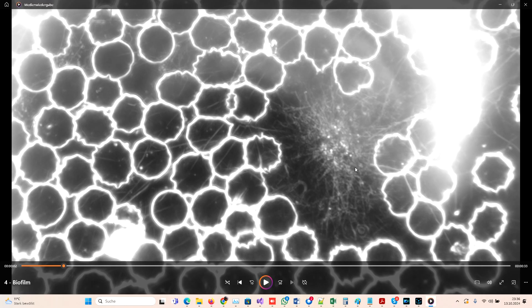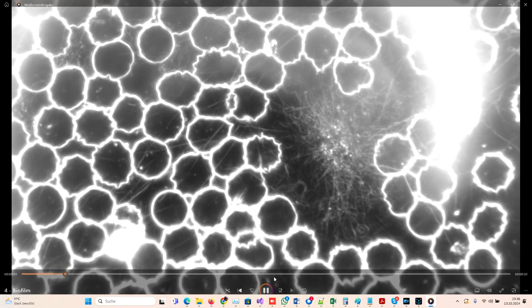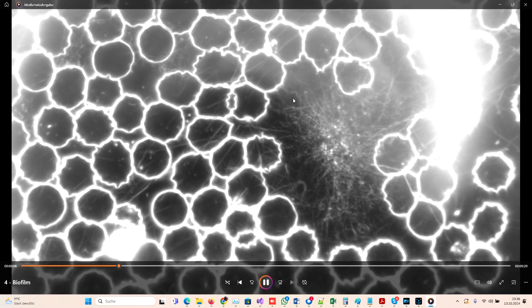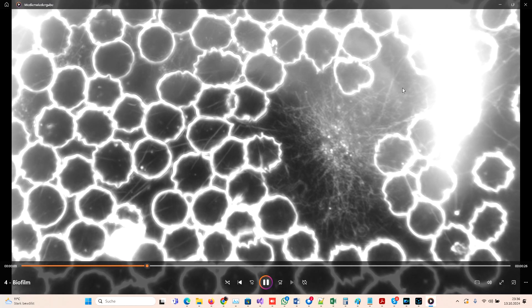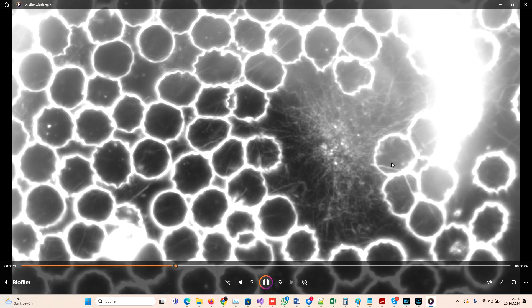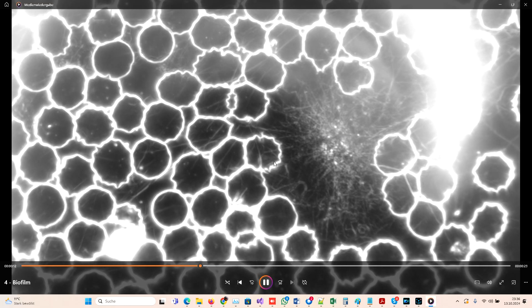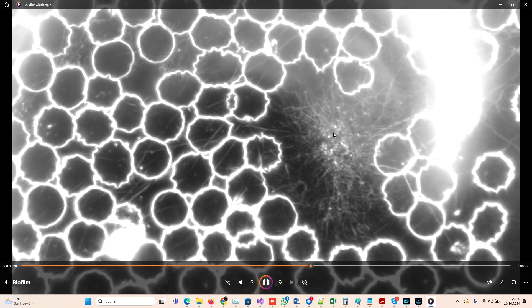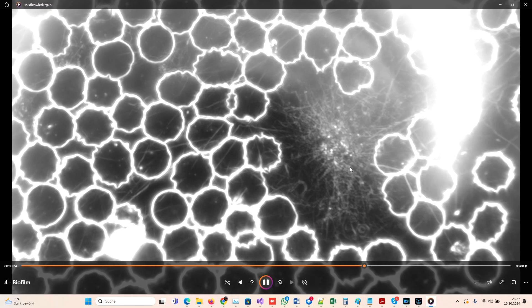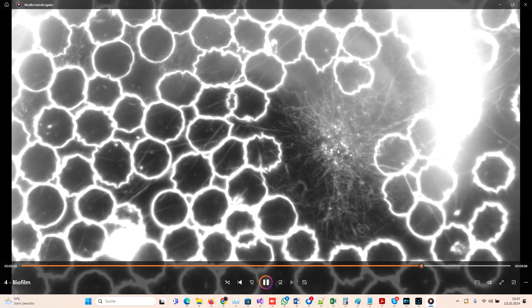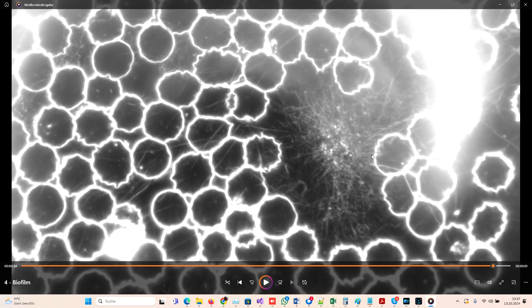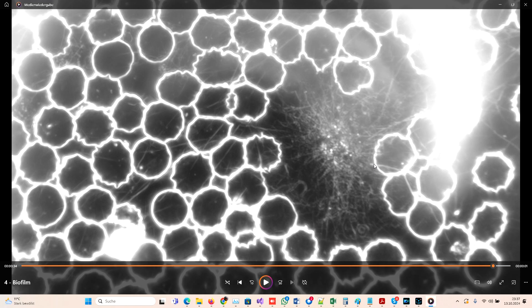The biofilm is something where a lot of spirochetes come together and form a biofilm, and usually this biofilm also contains some cysts, those round-shaped things. I think that what we see here in this video is a biofilm of Lyme bacteria in that area. You see those long, kind of spiraled things, and in the middle we see these dots, and these dots, to what I believe, are the cysts. The thing is that I read some studies that in order to kill the bacteria in the biofilm form and also in the cyst form, you need a way higher antibiotic dose than for example in the spirochetal form, and this is really a problem when treating Lyme disease.